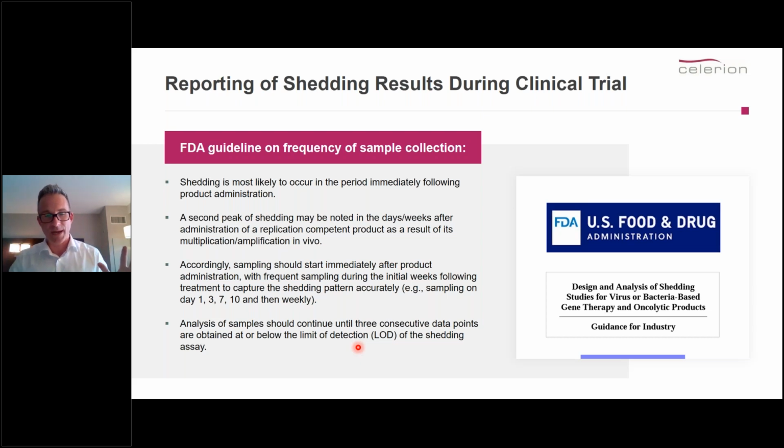So here we get into an area where the turnaround of your samples is hugely important. Those samples, especially when it comes to the 3 below the limit of detection, negative results, when the samples come in, you do need to provide a result very, very fast.